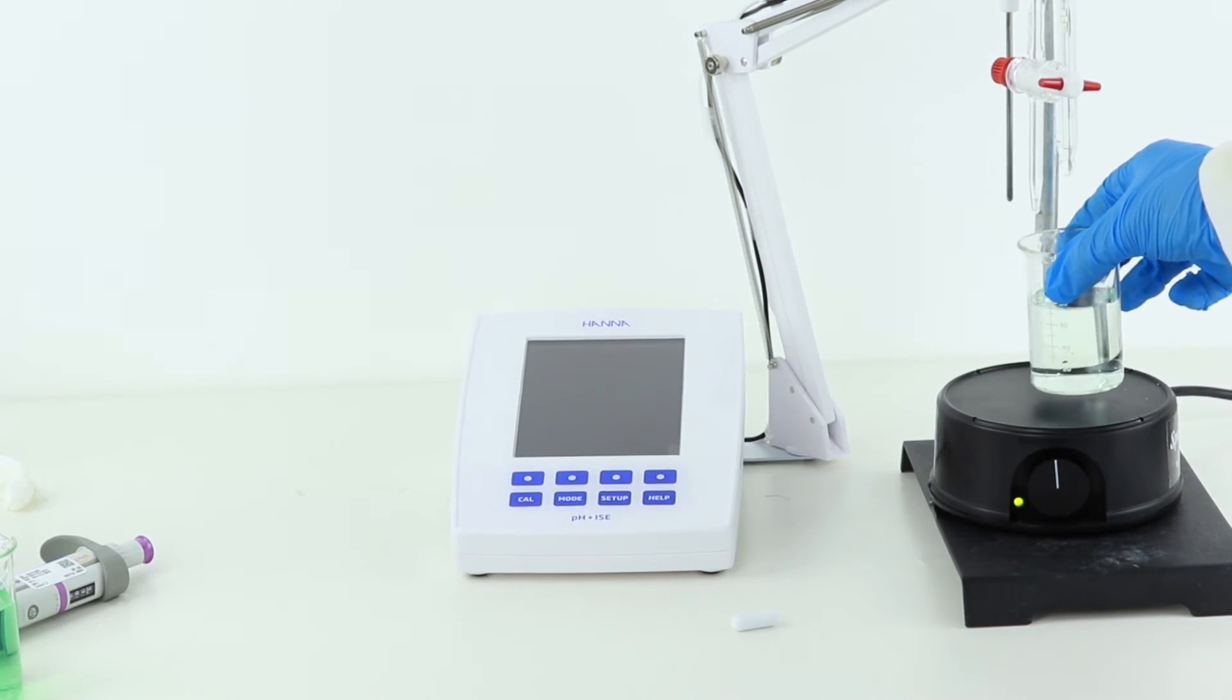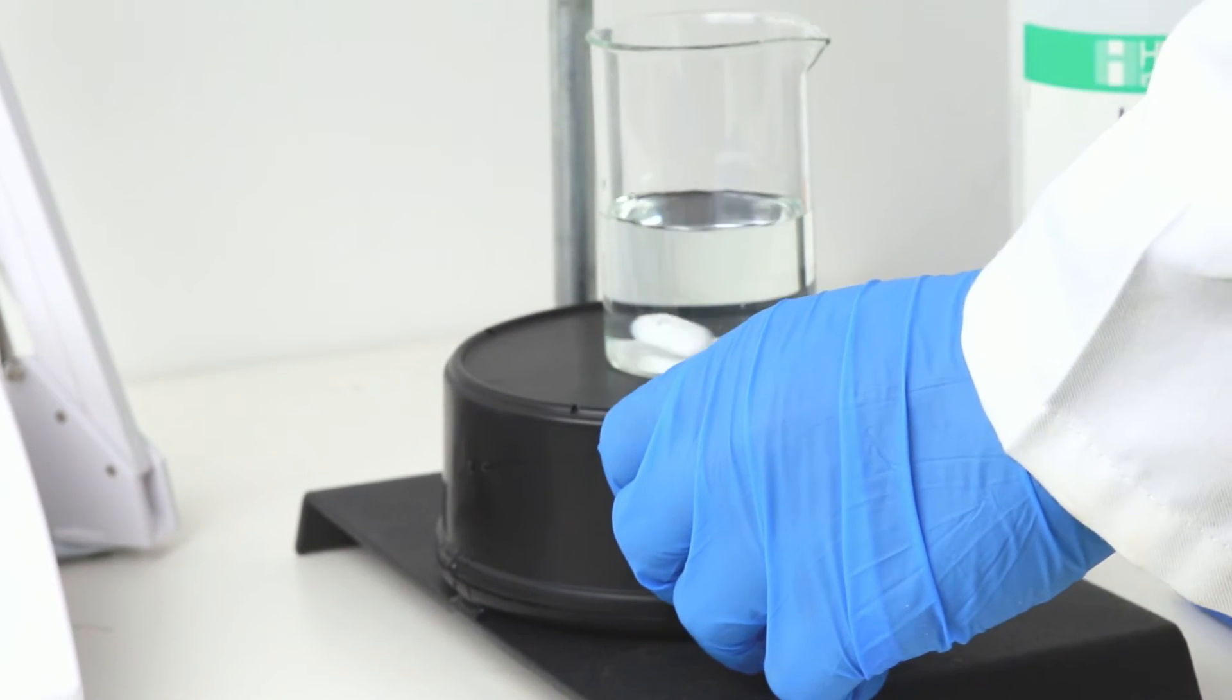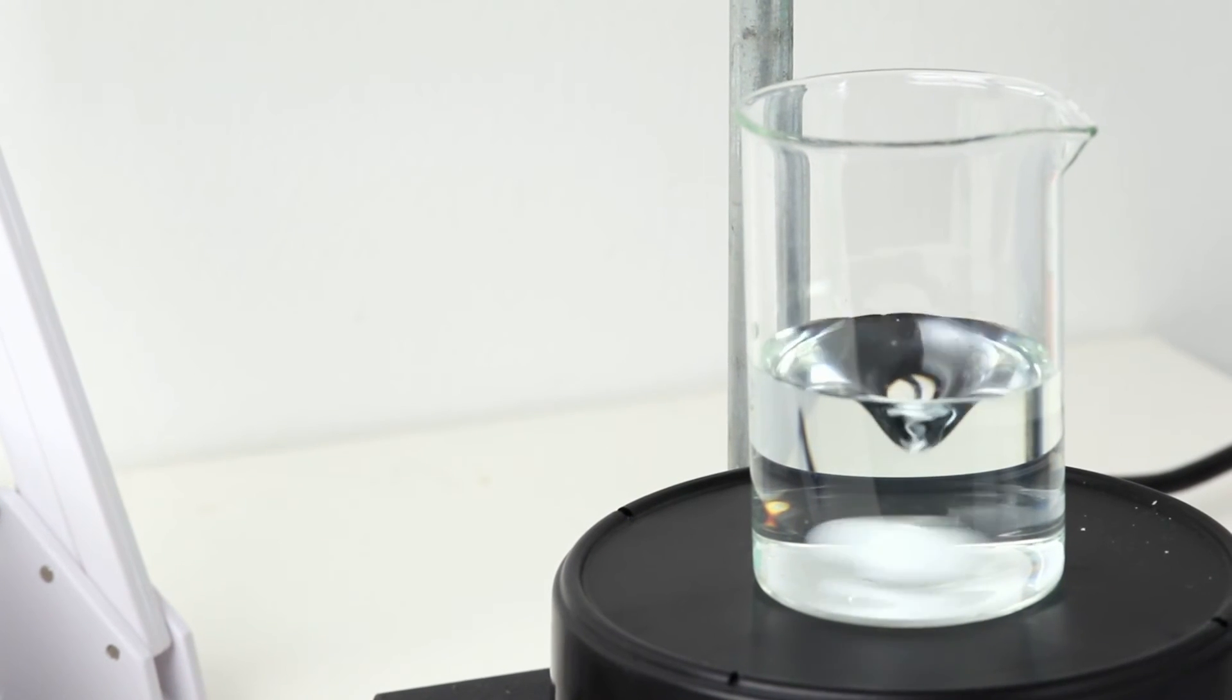We'll put the sample on a magnetic stirrer, add a stir bar, and begin stirring. It's important to constantly stir throughout the titration.